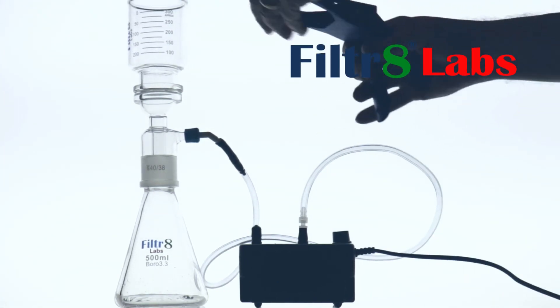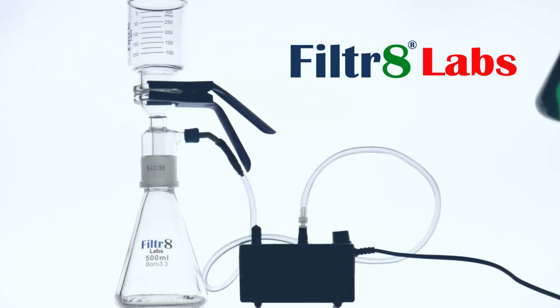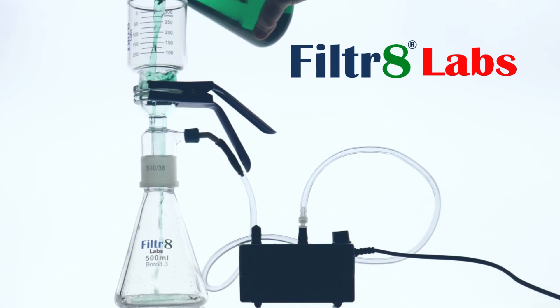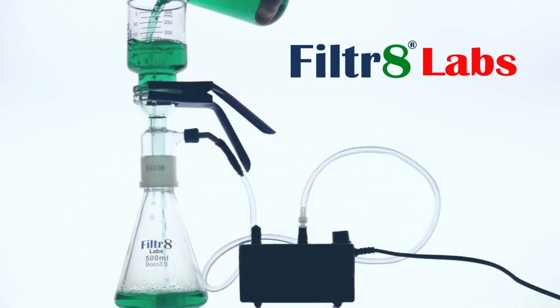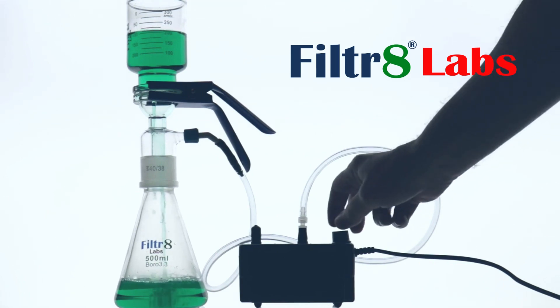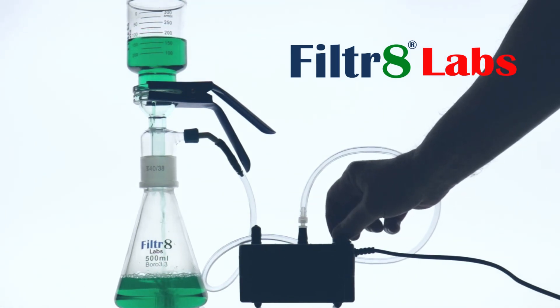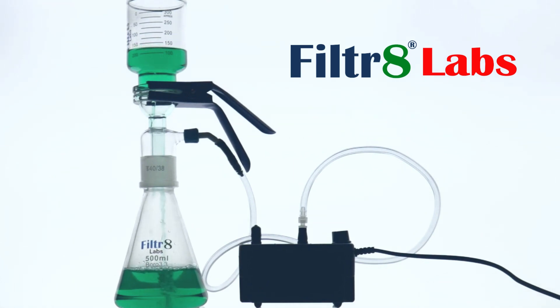Now go ahead and clamp your funnel to secure it, and you can pour your solution in. What this does is make sure you don't get any air pulled around the side of the filter.